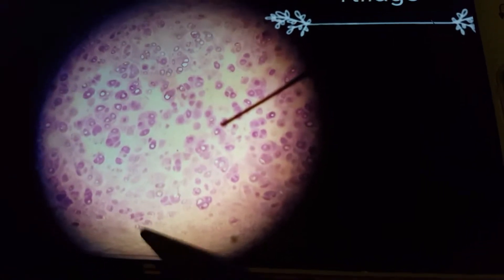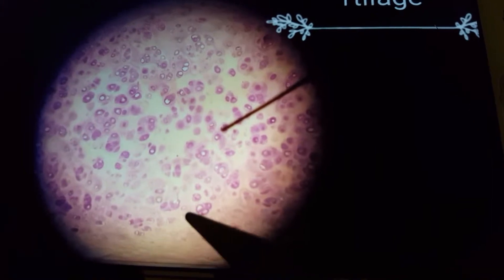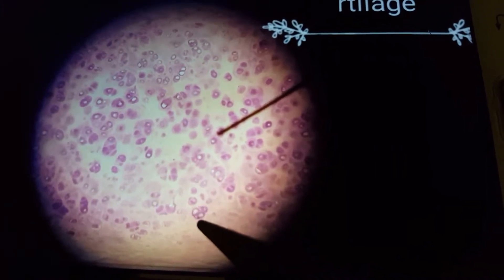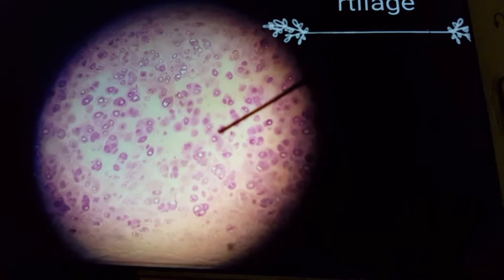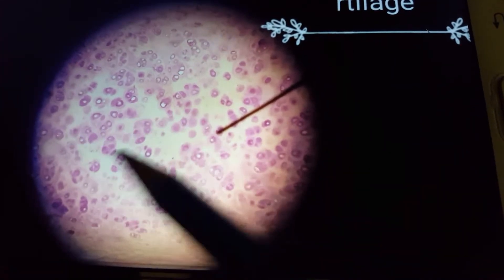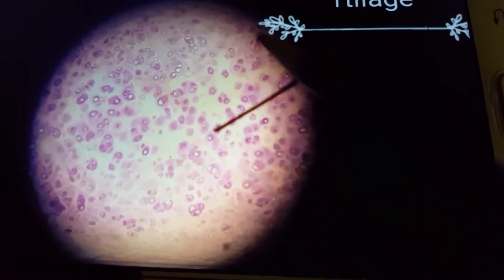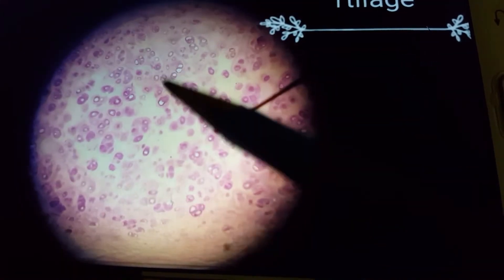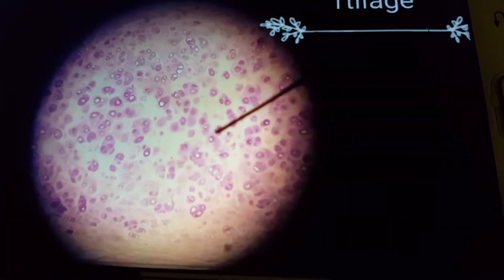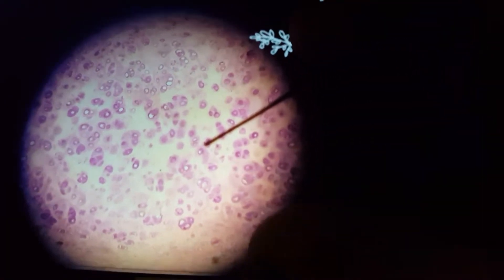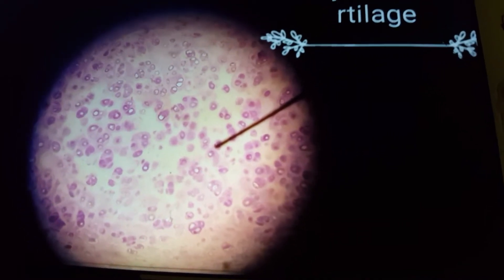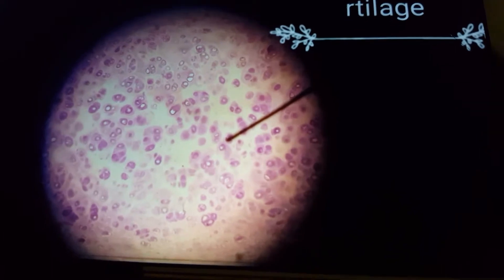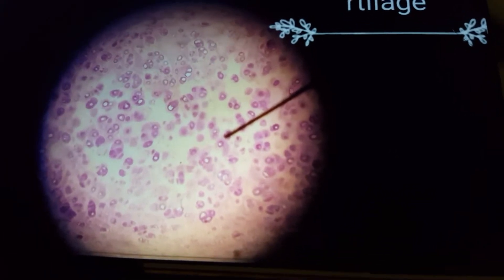Here you can see the perichondrium. Then we have lacunae with chondrocytes inside the lacunae, and then we have the ground substance. So these are the three points: lacunae, chondrocytes, ground substance, and most importantly, perichondrium. Whenever you are defining hyaline cartilage, you have to write about perichondrium.